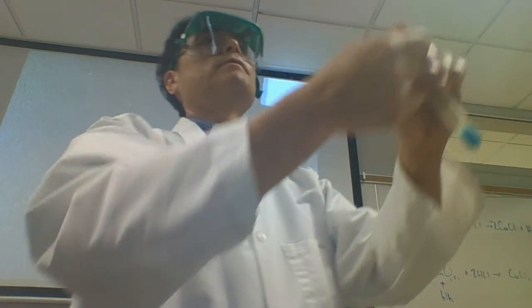Actually, let's just get a cork. That clear colorless gas is slowly turning orange. Do you see the orange gas there?